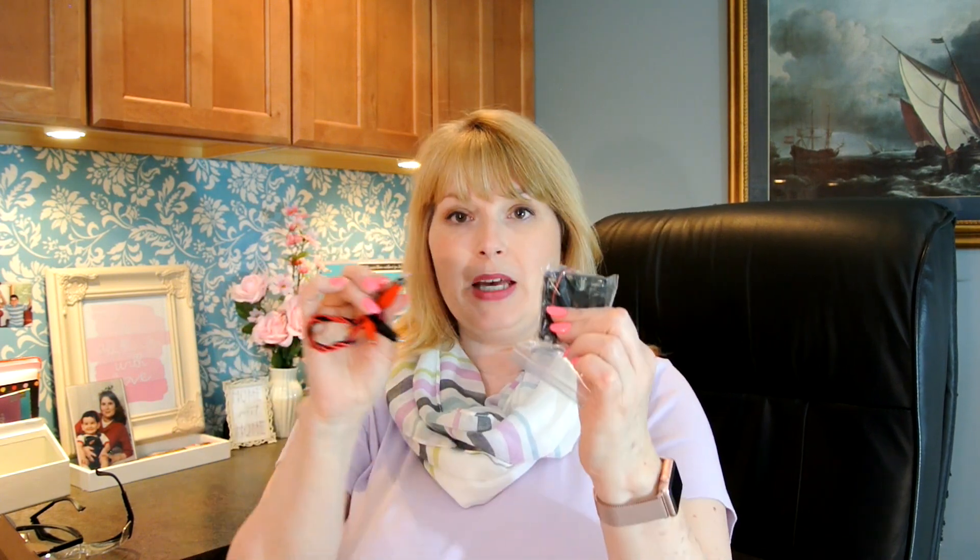Finally, you also have battery clamps, and I'm sure this goes with the battery supply case. So obviously you're going to do some kind of electrical reaction to cause the tin and these ingredients to react. I've got to tell you, this is pretty cool — I'm actually really excited to do these. And here's a larger picture of the hedgehog that a little piece of tin is supposed to turn into — that is pretty wicked looking. I think my students would be really awed by any of this stuff.